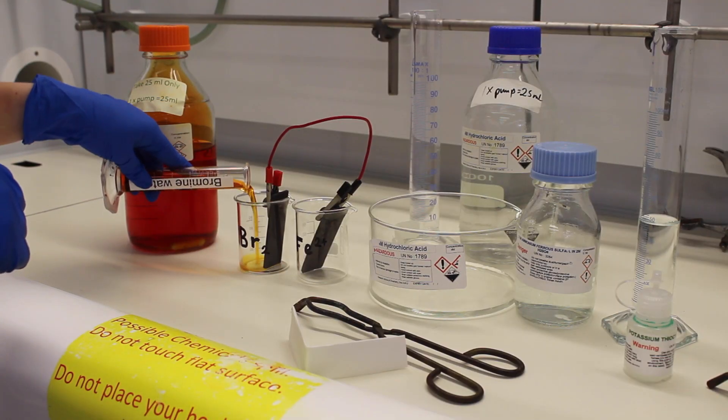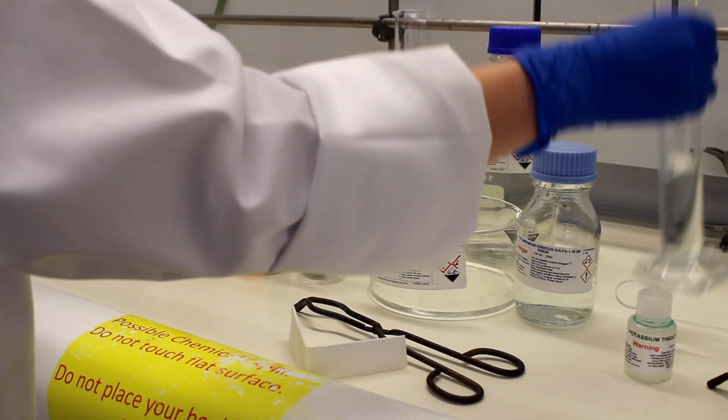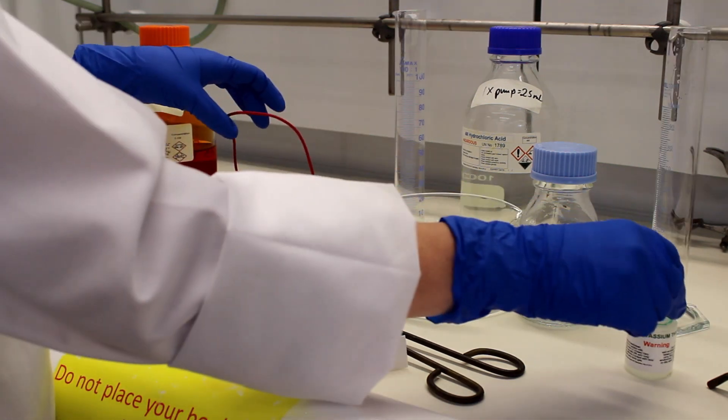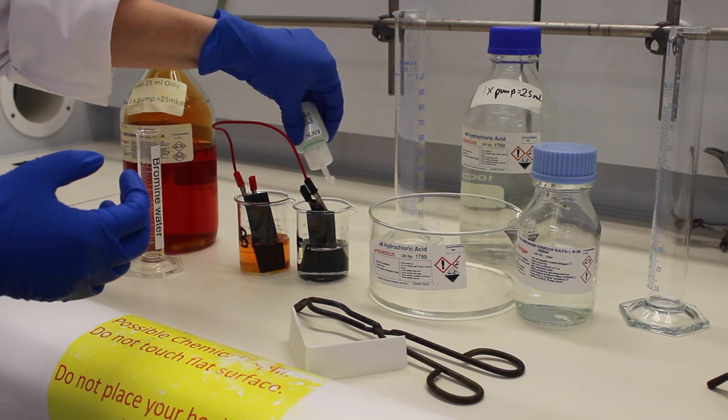Fill one of your beakers with 25 ml of bromine water and 25 ml of hydrochloric acid. To your other beaker, add 50 ml of iron 2+ solution and a few drops of potassium thiocyanate as an indicator. Have one rod in each beaker connected by the wire.